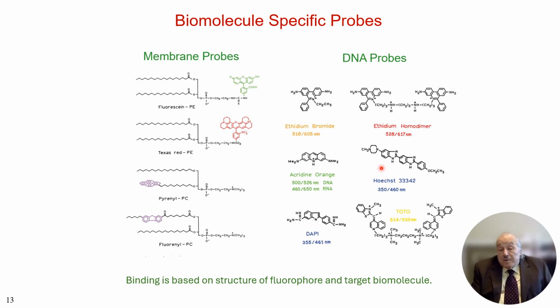And a similar thing with the DNA probes. A number of probes bind to DNA. Some of them intercalate into the DNA. Some of them bind to the small groove. But the basic principle of all these dyes is that when they bind into the DNA, they become more fluorescent, which makes them, of course, visible above the background. And in some cases, they cannot be washed out. So you can wash the DNA forever and the probe stays there.